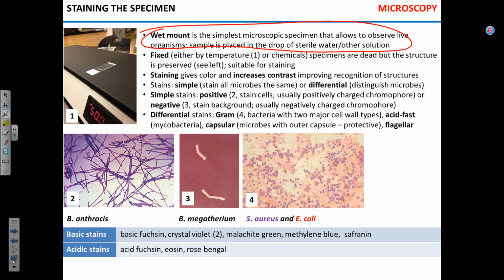Okay? If you have taken 1510 or 1200 here, you may have done a microscopic study of water. Have you? Some of you? And if you look there, there are some little creatures, protozoa, mostly paramecium, that swim around. To trace one is really a task because they're fast. Okay? Same goes for bacterial cells. They can move, and in many cases you want to stop them before you observe them, so they don't go anywhere. Does that make sense?